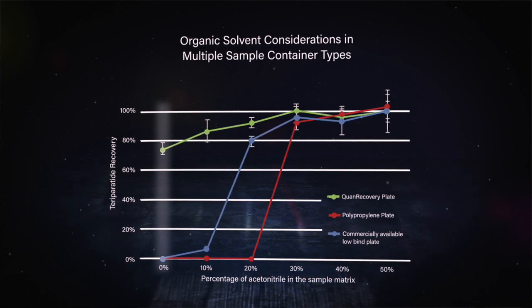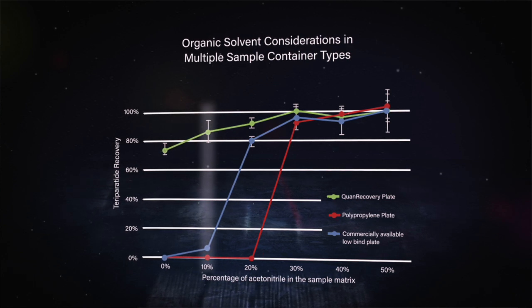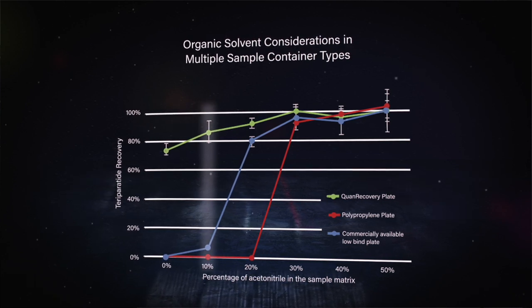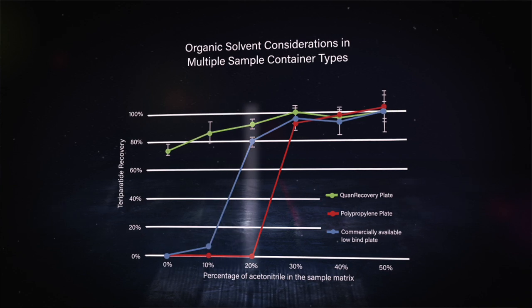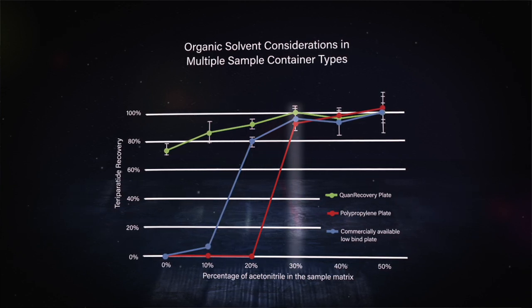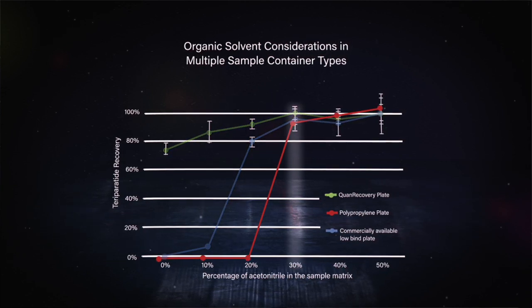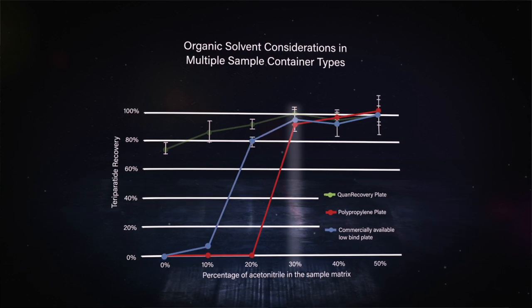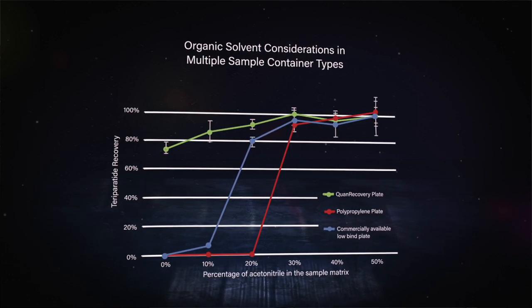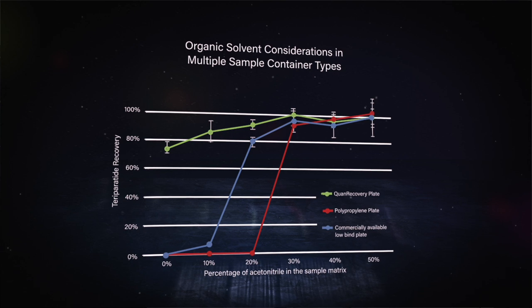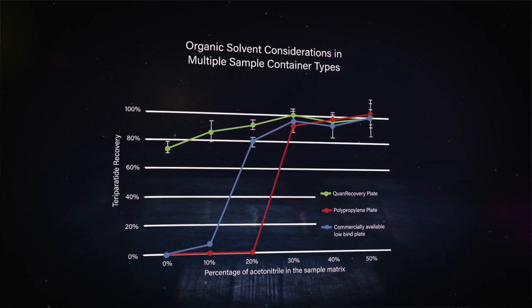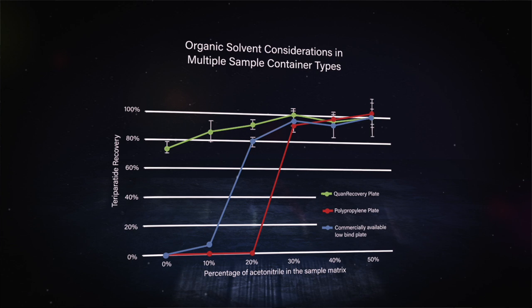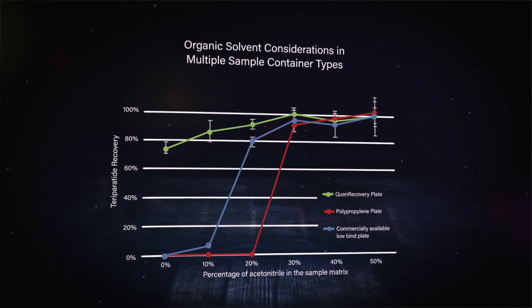As we get up to around ten percent, we're getting really good recovery in the Quan recovery plate. We have to get up to about 15 to 25 percent before we have that kind of recovery in the polypropylene and the other low-bind plate. I see that — but my question is, why not just stick with 30 percent acetonitrile? Yeah, it does look like you could go up to 30 percent acetonitrile and then it doesn't matter which plate you use.